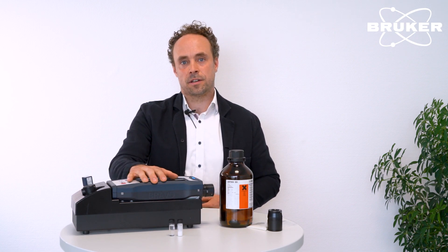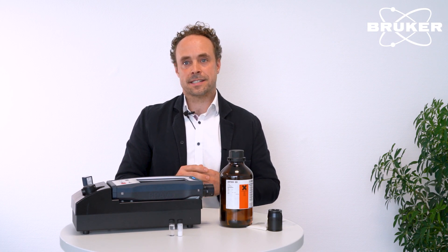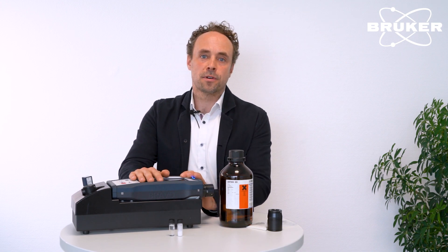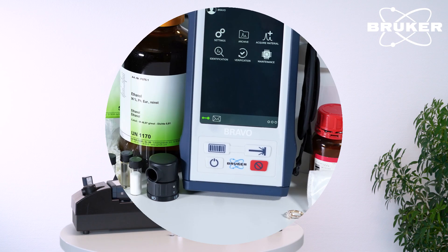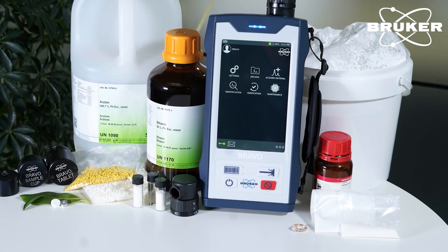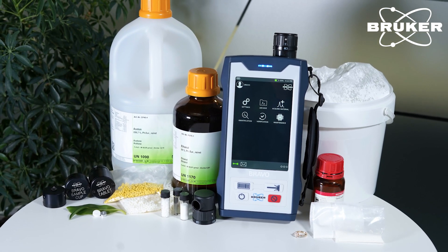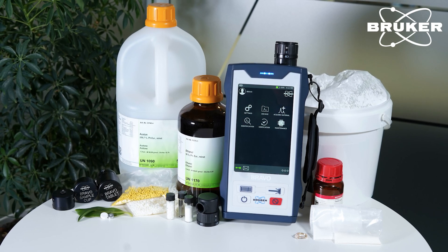During the demonstration, I did not wear any laser safety glasses. Good to know: the Bravo is laser class 1 safe in all operating modes. I hope you liked our small demonstration of the handheld Raman spectrometer Bravo — with benchtop performance, especially suited for those challenging samples in the pharmaceutical environment, for example those that exhibit a high fluorescence emission.